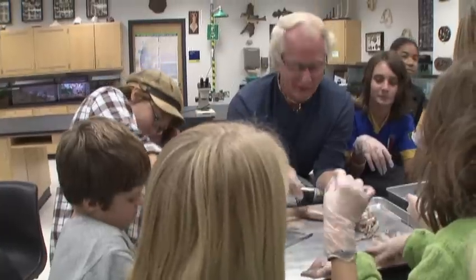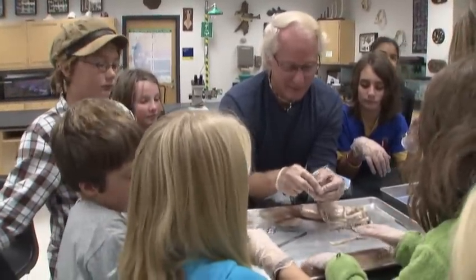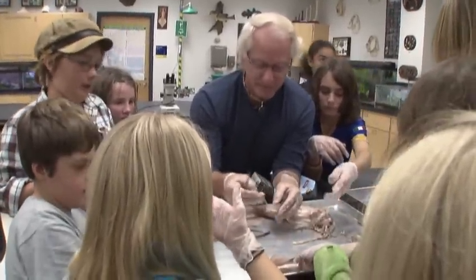How can you tell which one's male and which one's female? This is the all muscle one here. Take that off. Well, we're going to open it up and we'll see if we can find whether it's a male or a female. Where does the fuse come from? Here, I'll pass this one to you. Oh, they're all folded up. Yeah, they can.